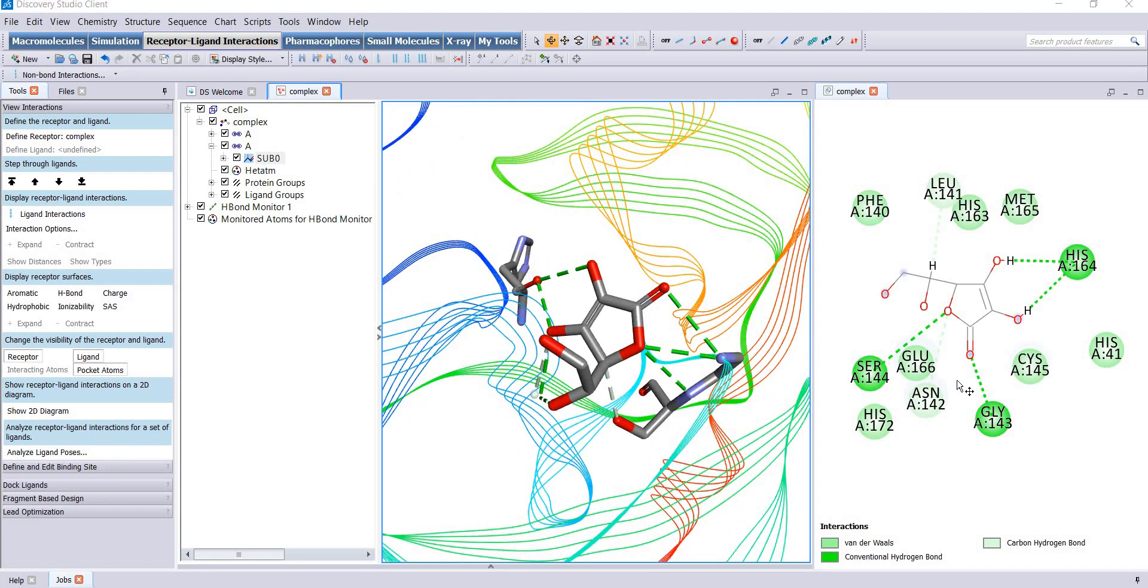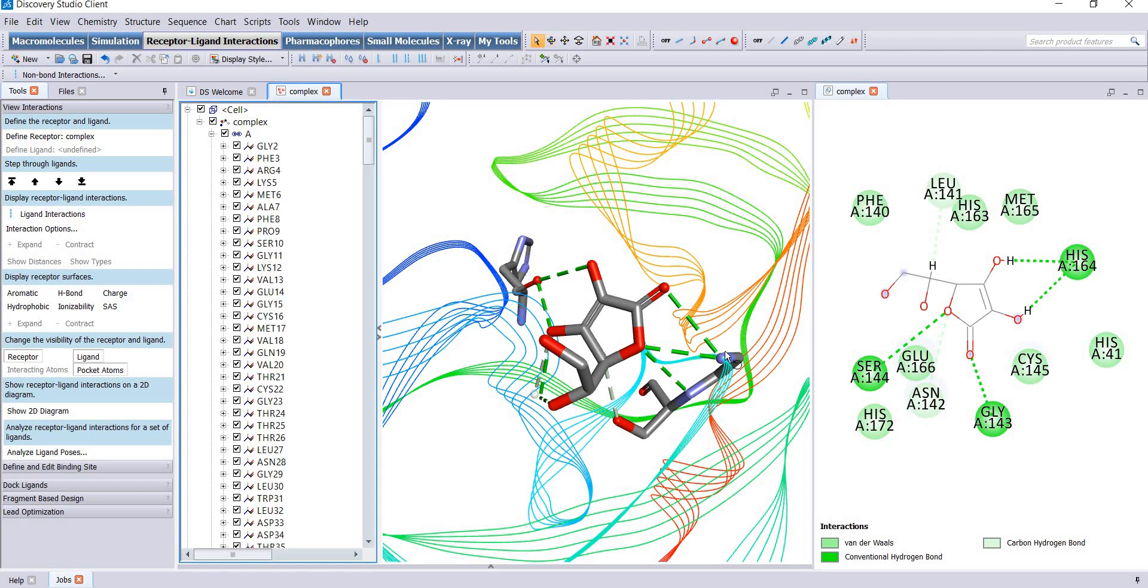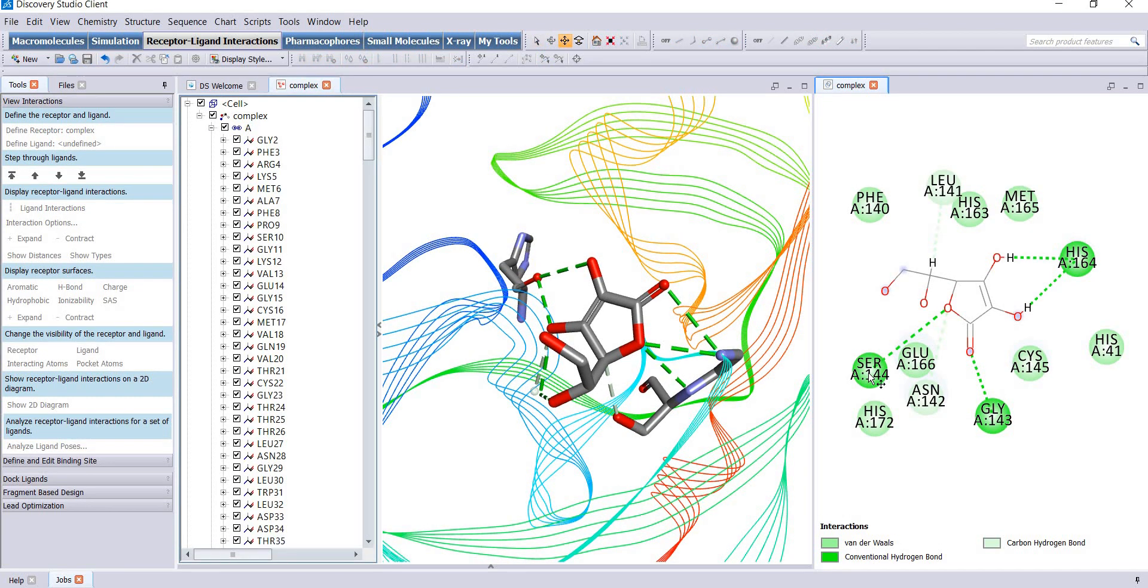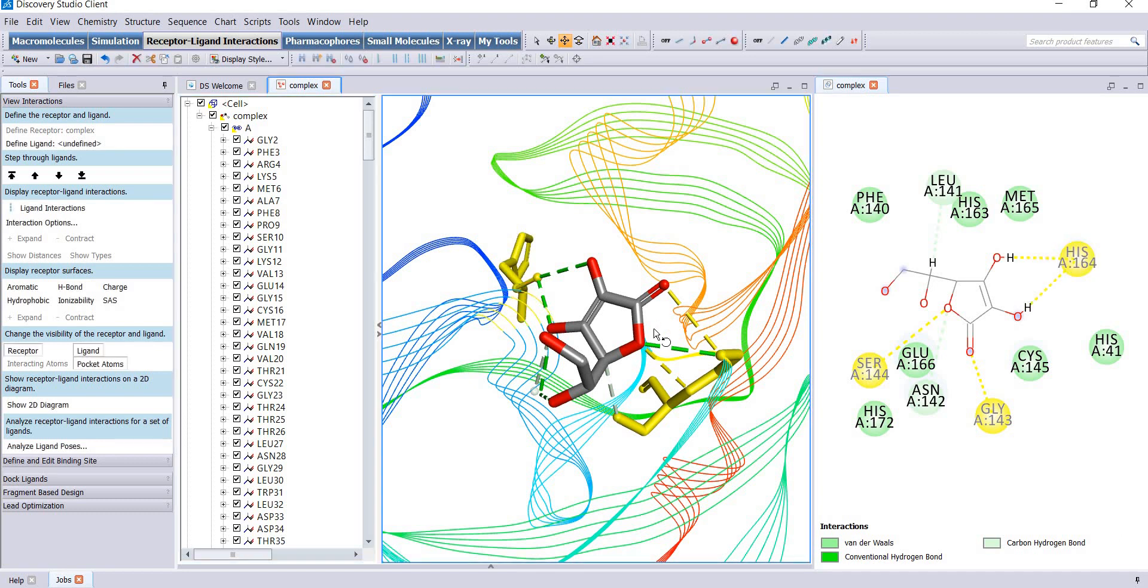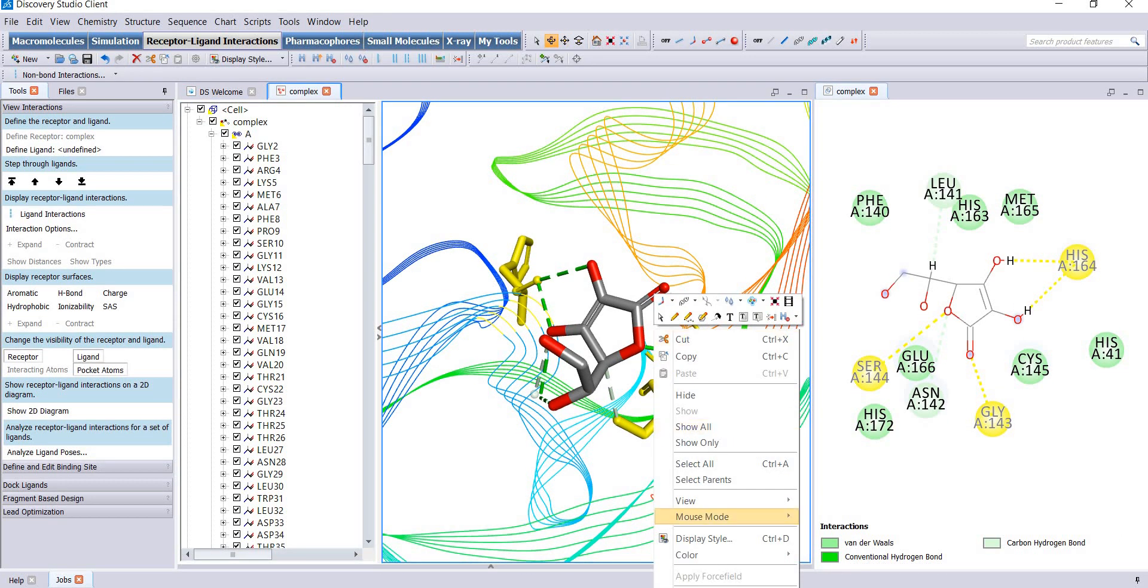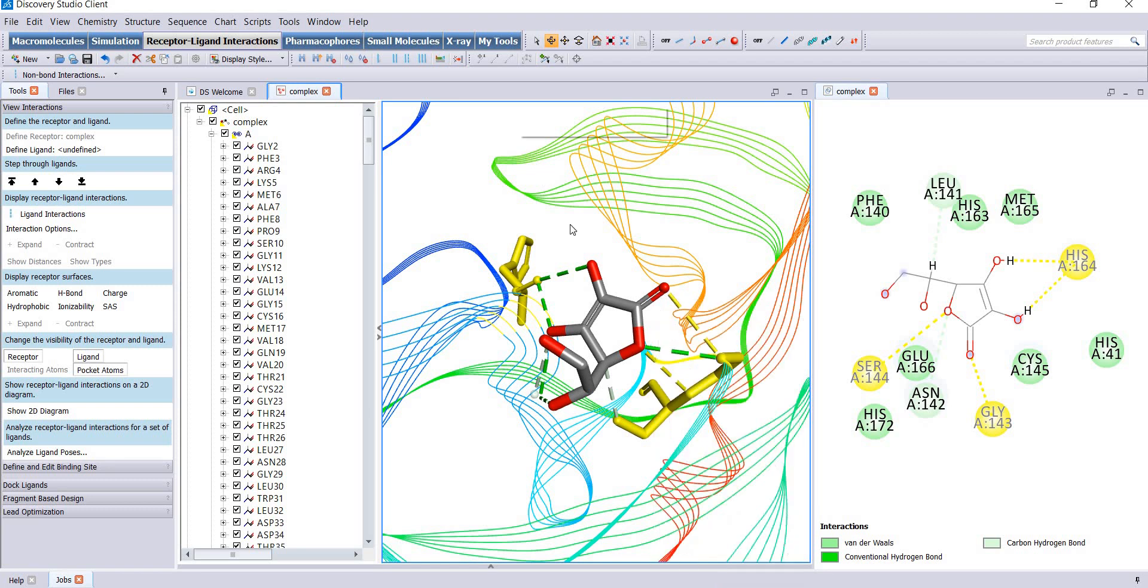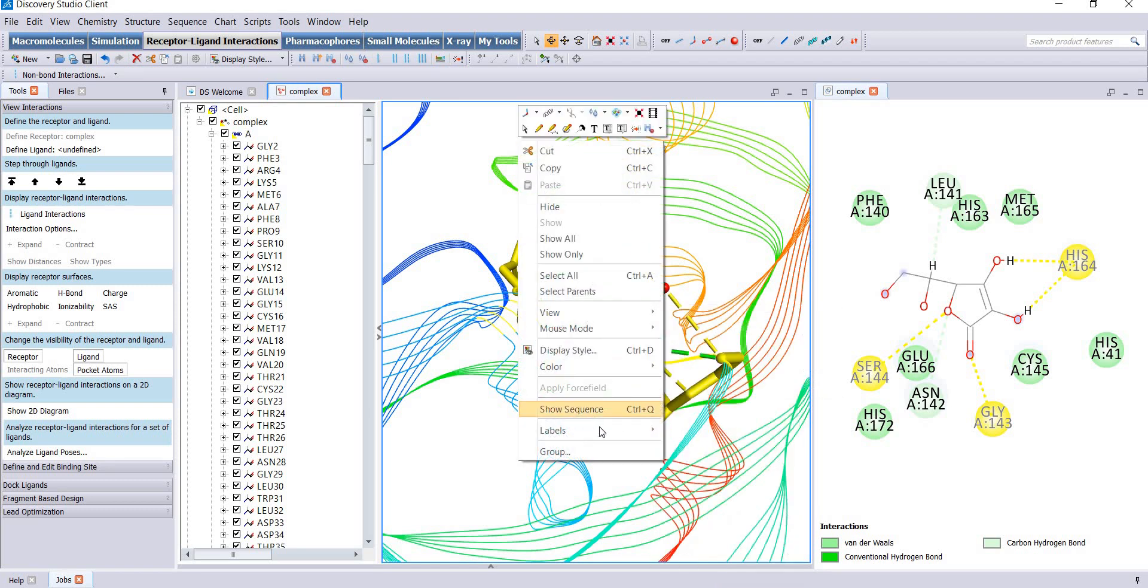Now you need to label the amino acids. You can either select from this window. I will take a shortcut and select the hydrogen bond forming residues, right click and go to labels, add.